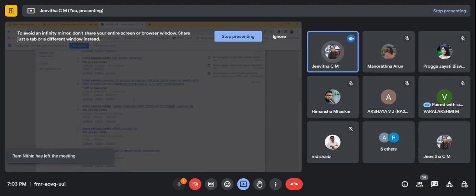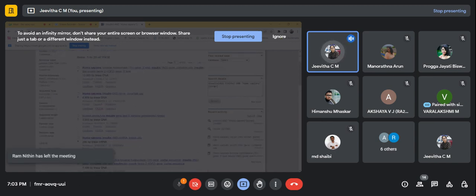You should not get confused when you are taking a sequence from NCBI, because NCBI shows you the data based on the submitter. If I am submitting an insulin sequence with a 3000 base pair length, it differs from the other entries.